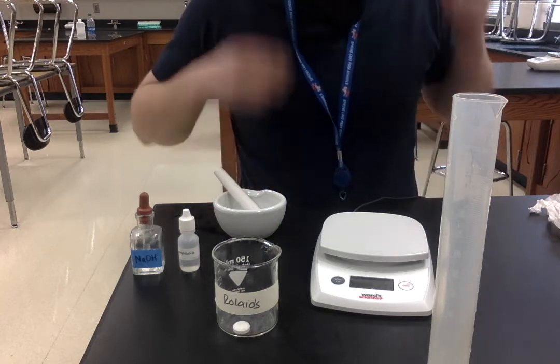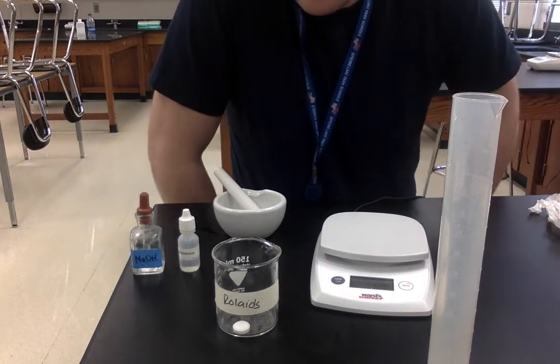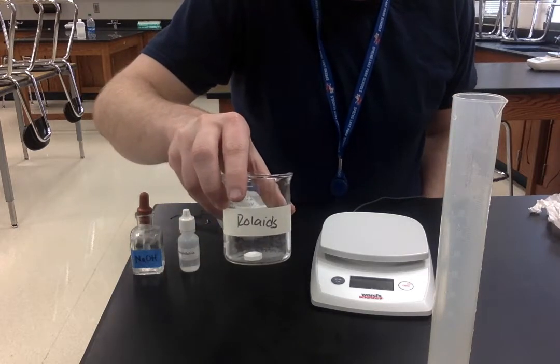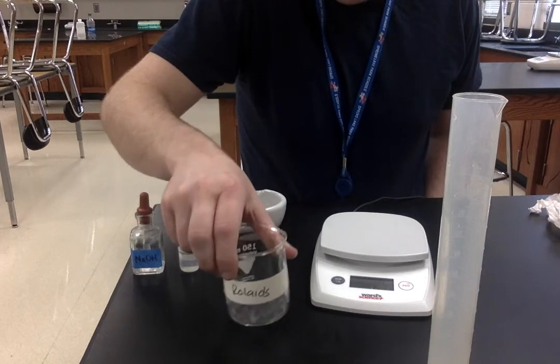Welcome to your last trial. On this trial we're taking Rolaids, that's our brand of antacid.